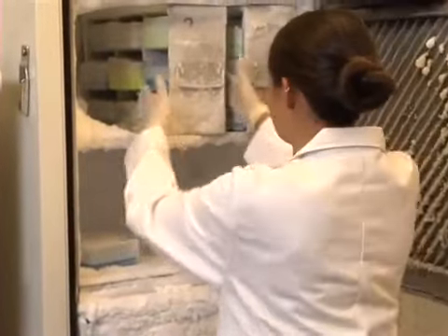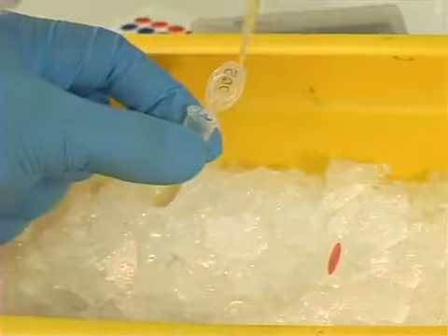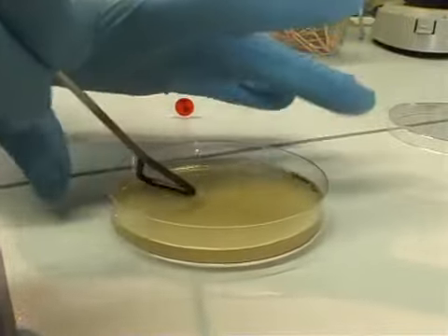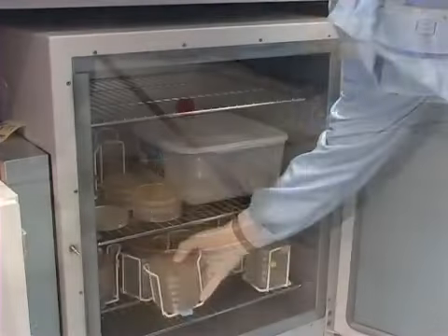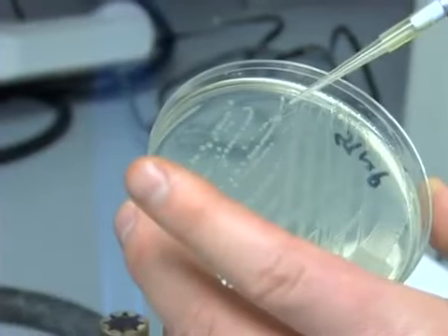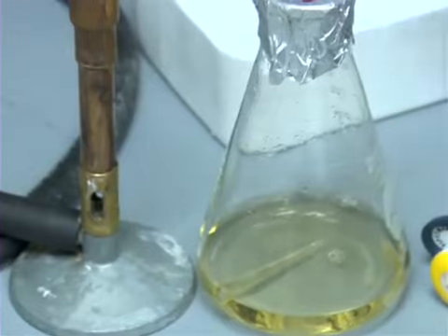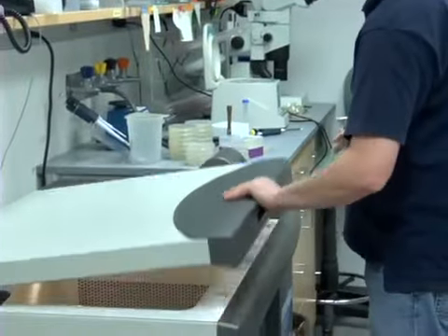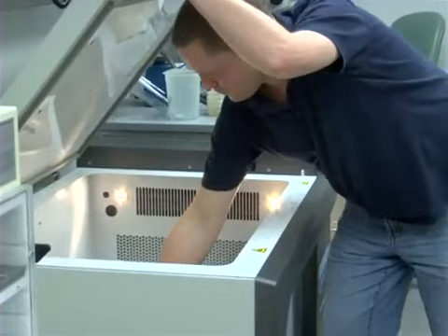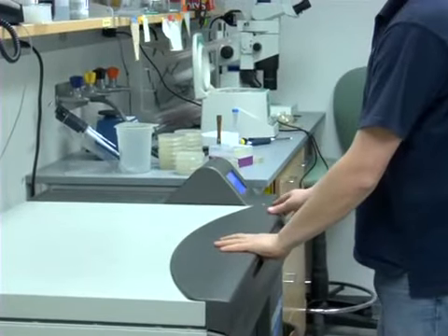Prior to being made competent, the bacteria used in transformation are stored in the freezer. They must be thawed on ice, spread on an agar plate without antibiotics, and allowed to grow overnight at 37 degrees Celsius. Using aseptic technique, select a bacterial colony from the agar plate and grow it up in a large 500 milliliter culture overnight at 37 degrees Celsius in a shaking incubator, an instrument which prevents sedimentation of the bacteria and even dispersal of nutrients in the media.